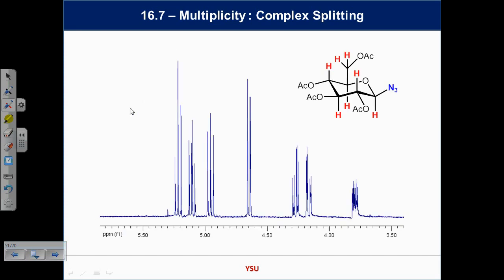Now, what I thought I'd do is bring in a couple of pictures. If you want to take a picture of this, go ahead. This is just FYI, but it's the type of stuff the honours students are doing for their projects this semester. We make a lot of this molecule. This is an azido sugar that we make a lot of to do various reactions with, and it's got a very interesting NMR spectrum. It is quite complicated compared to what you've seen, but you should be able to work out some patterns. Over here, this is a triplet.